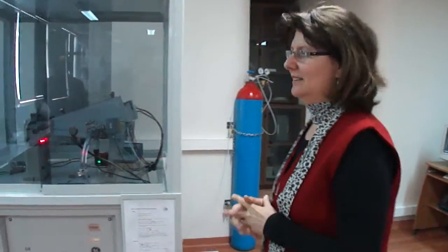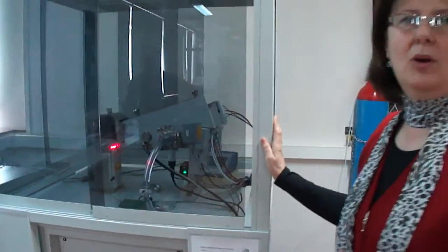As I said, this SWAX system, small angle and wide angle X-ray scattering system, is very valuable for us. This is unique SWAX equipment in Turkey.